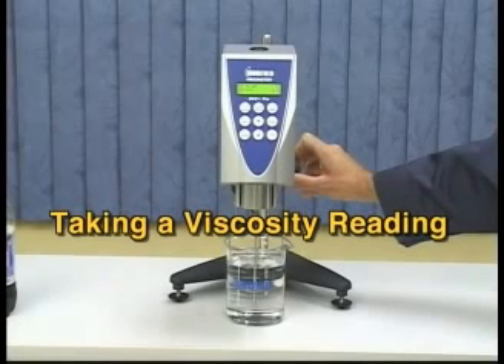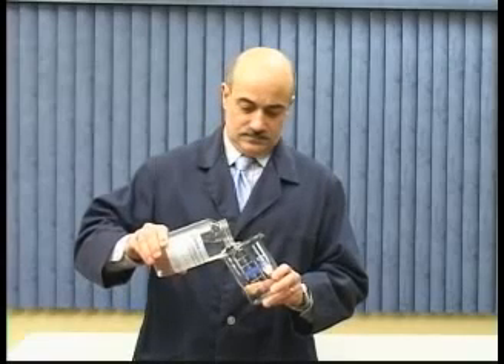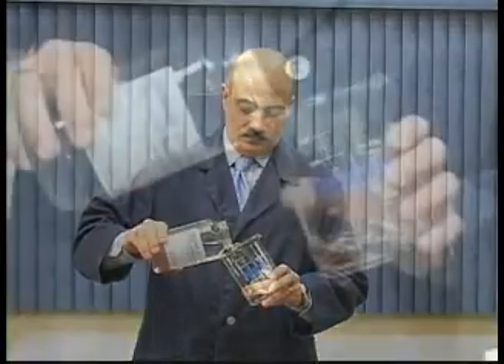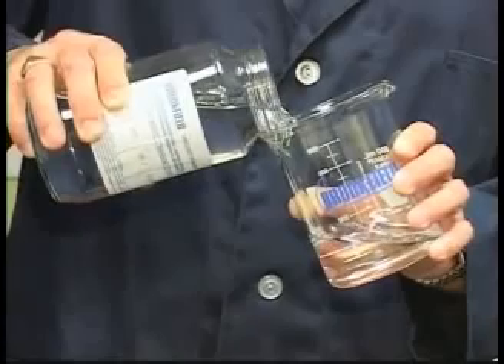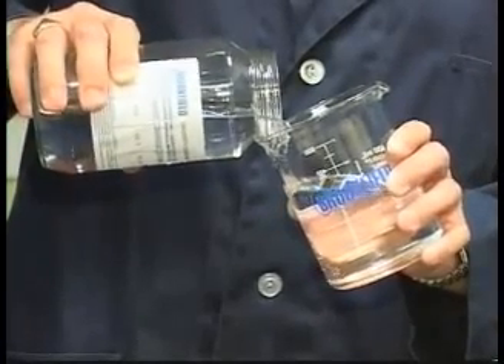Start by filling your beaker with the sample material. Air bubbles in your sample can cause high readings. Tilting the beaker as you pour your sample will help limit air bubbles.